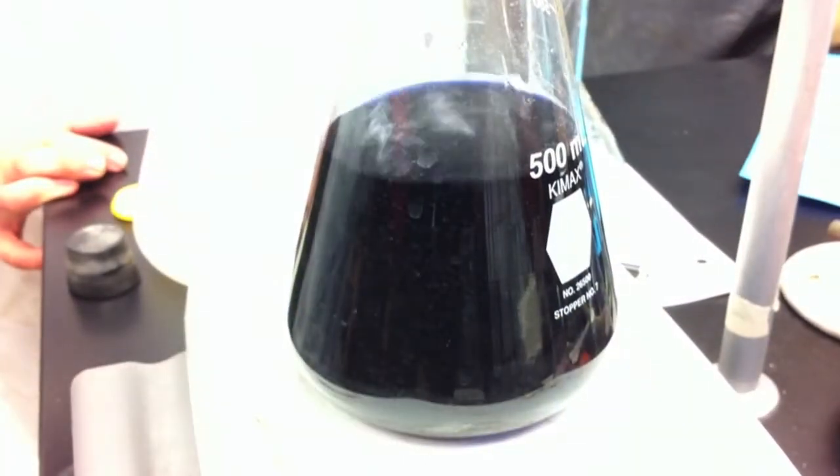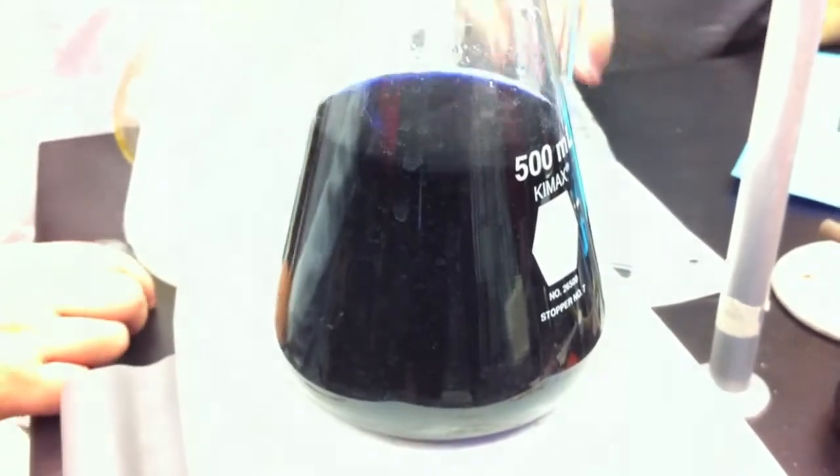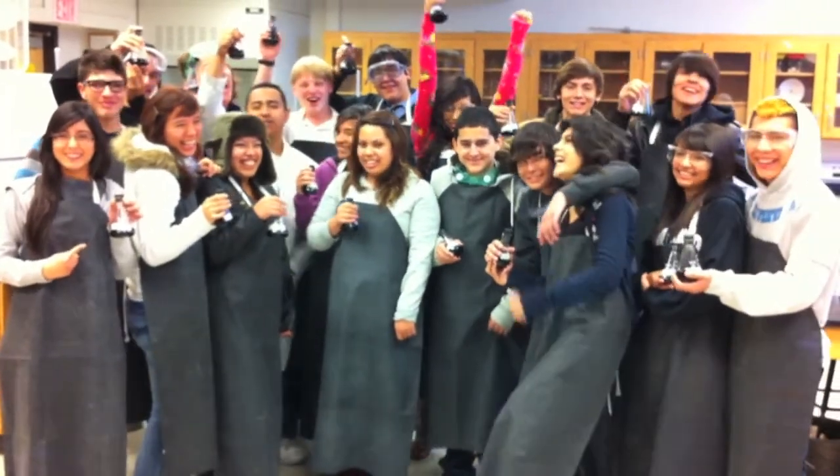Whoa, there you go! See it now — it actually turned purple for a second, then it turned clear. Yes! Yeah! Good shot, good shot!